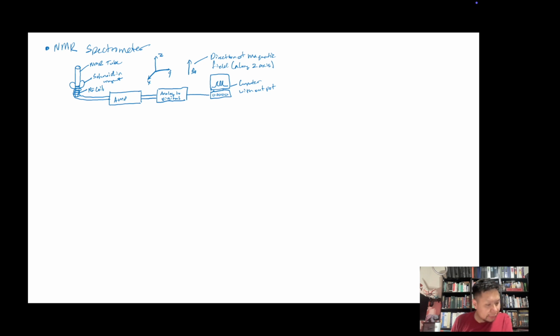So as I was saying before, the magnets inside of modern NMR spectrometers are not just magnets, and they're not just electromagnets. They're actually superconducting magnets. And so, even though our NMR isn't like that, our 60 megahertz isn't like that, but if you have anything that's higher field, anything like a couple hundred megahertz and bigger, those are all superconducting magnets. What does it actually mean to be a superconducting magnet? It means that the electromagnet has been cooled down to liquid helium temperatures so that there's a very minimal amount of resistance, right? And so the magnet becomes superconducting.